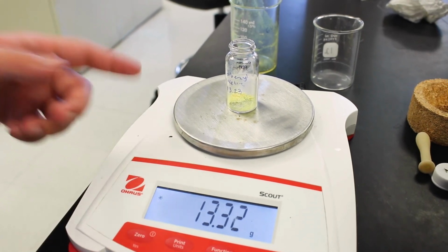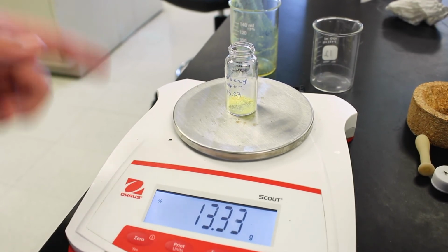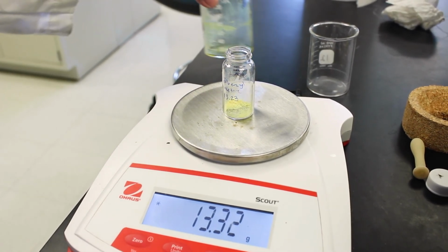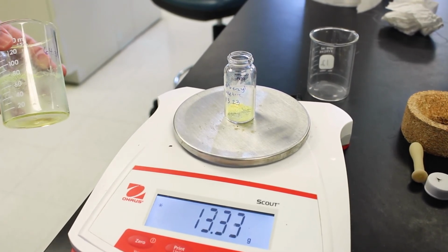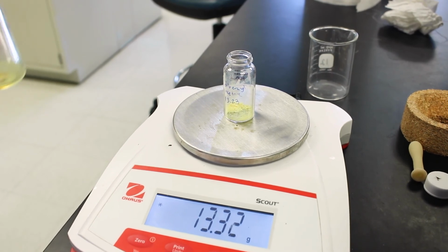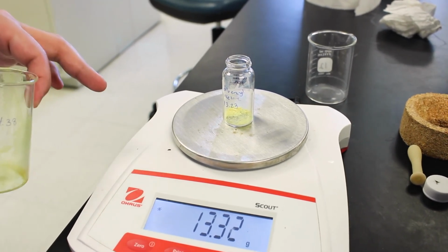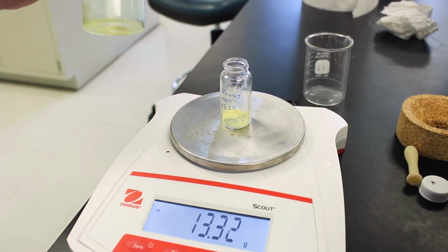All right, so here's our product in here. The mass of it is about 100 milligrams, 0.1 grams, which is incredibly low given the scale we're working on. To account for that, if you'll recall, we added a certain amount of ethanol based on our crude mass, so how much solid we collected immediately after the reaction, and we had about 7 grams. There's some water in there, but we're in the gram level, so there were substantial losses here. We've gone from perhaps 5 grams down to 0.1 grams, and that is most definitely accounted for by the washing step.